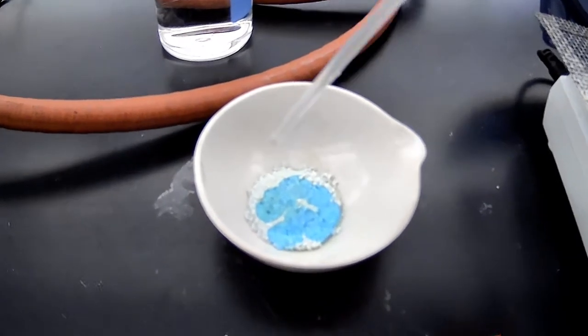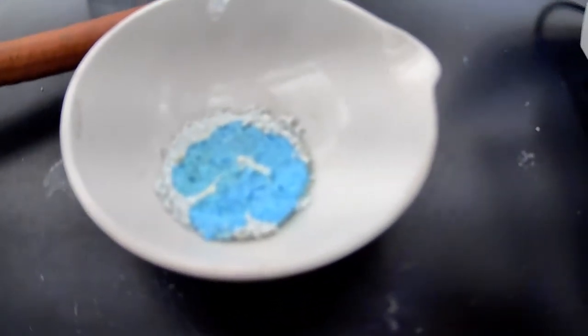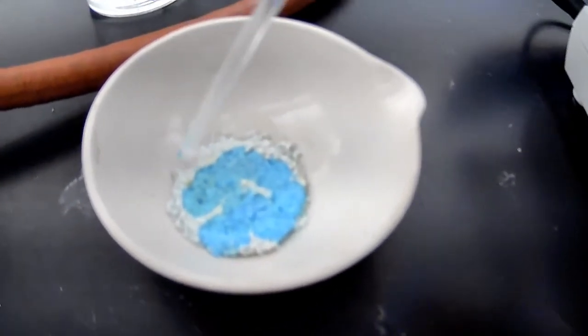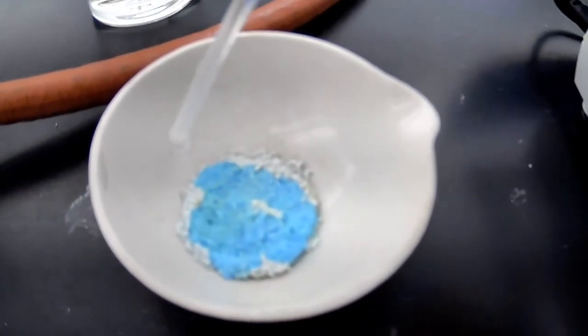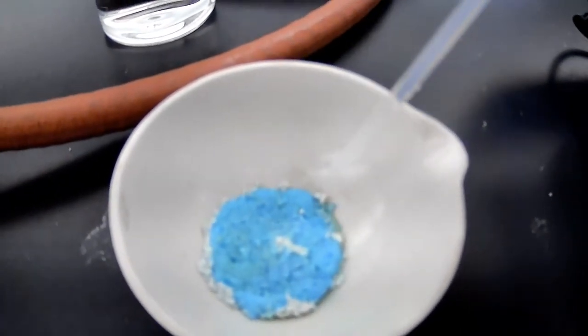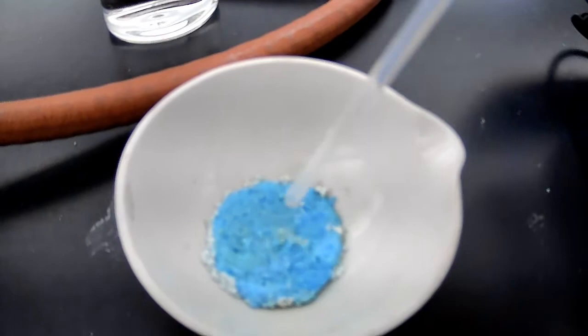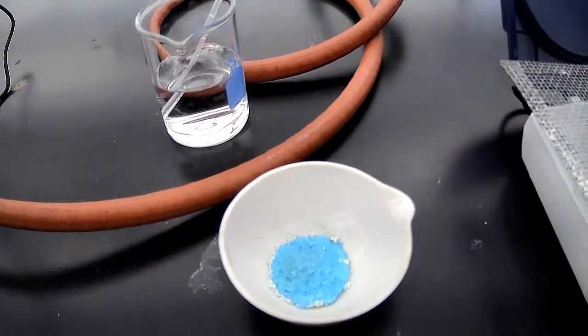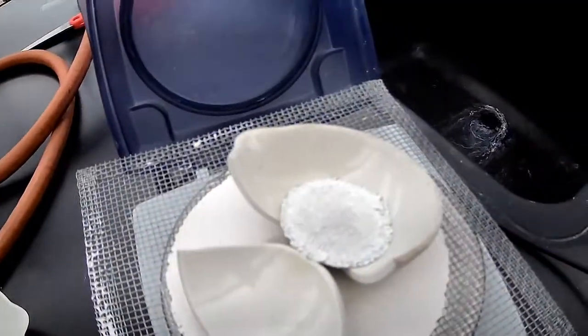But you can kind of see that as the water goes on... you can't hear the sizzle, but you can see the bubbling though. All right, so that's your copper 2 sulfate pentahydrate.